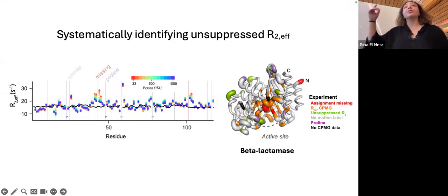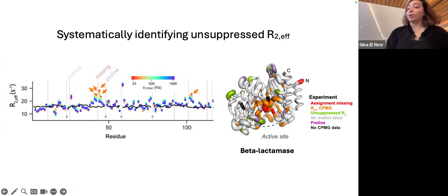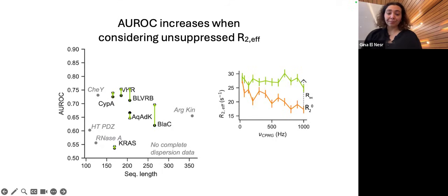And so if we incorporate those and say things that are at that field strength that are being unsuppressed are also dynamic, experiencing microsecond, millisecond exchange, and we incorporate that, all of our probabilities in that case go up. So you see the probabilities all go up there.